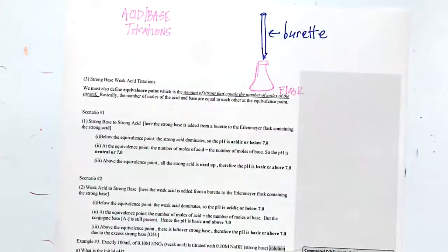A couple of terms here. What we are putting in, drop by drop by drop by drop, we're going to call that the titrant. Okay, that's the term. So the thing that you fill up the burette with, the liquid, is called a titrant.